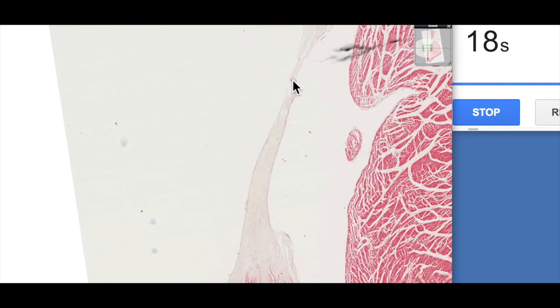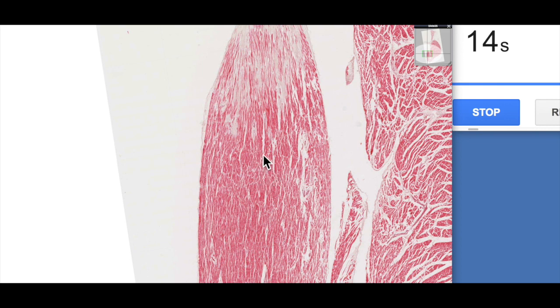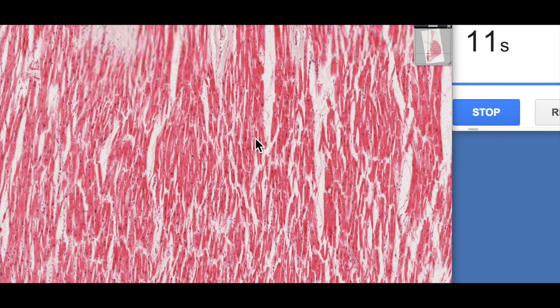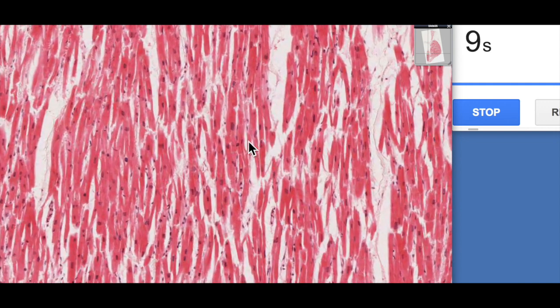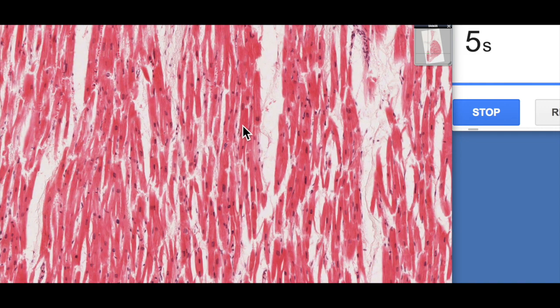Here we can actually see one of the attachments of the chordae tendinae, and then it ends in this papillary muscle, which is of course made up of cardiac muscle tissue. So these are the cardiomyocytes. You can see the nice branching, very typical of cardiac muscle cells with centrally located nuclei.